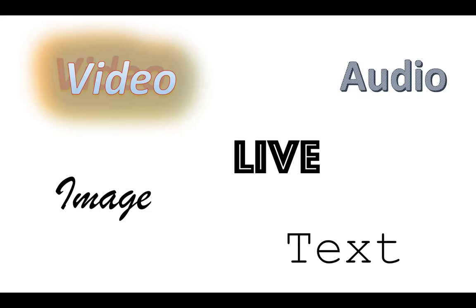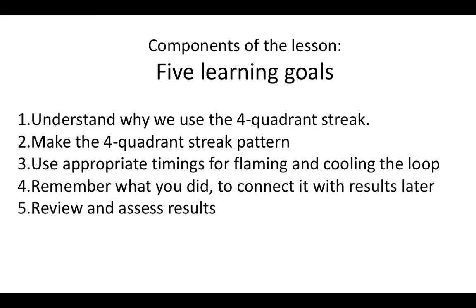Our traditional live demo has certain affordances. It combines voice and gesture with the affordances they provide, but it lacks others. By revising our lesson to include the modes most appropriate to the piece of information we're trying to teach, we should be able to create a more effective lesson. We've identified 5 component learning goals for our lesson on the 4-quadrant streak, but let's take just a few examples to show how this revision process might work.